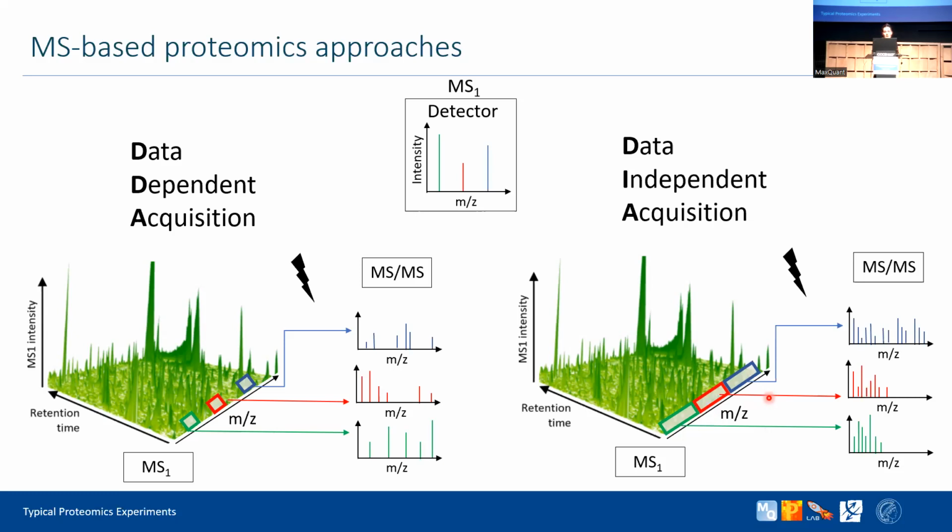and do the MSMS. As you can probably tell, the MSMS spectra for DDA and DIA have different properties, and of course, you have to use different algorithms to work on them. So these are the 2 different acquisition methods that you can use.